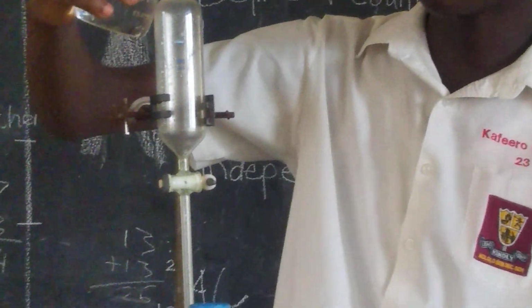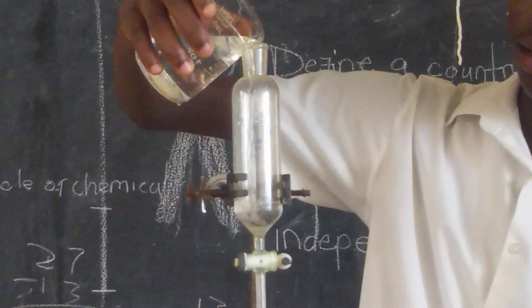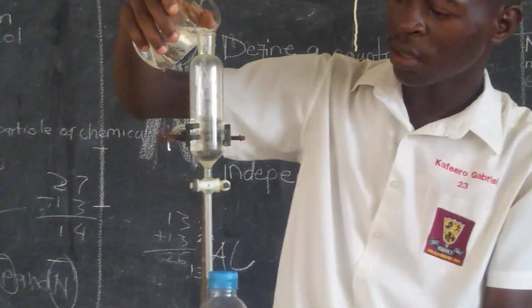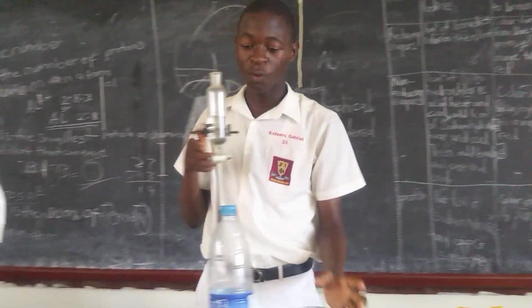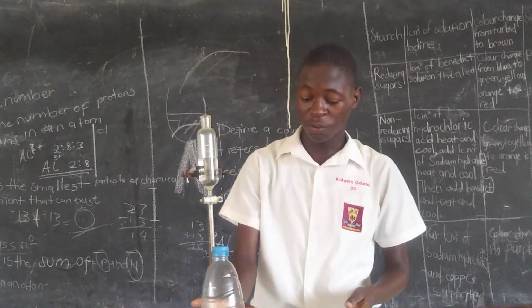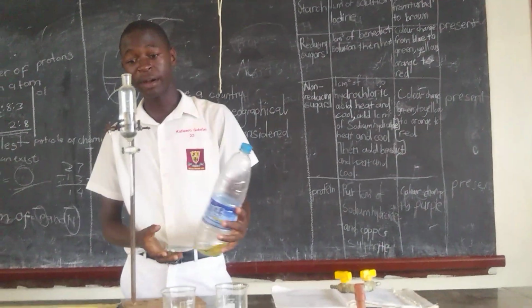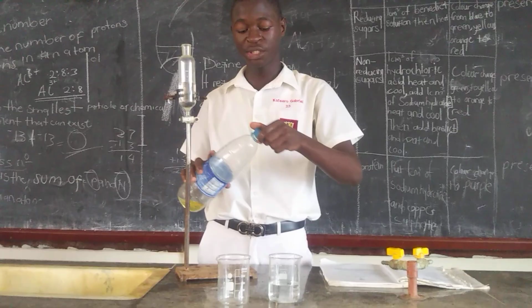Now I can pour my liquid. Let's see. When I pour the liquid, this water of mine won't pass through like the other time. So I have to pour it until it can be seen. Yeah, there, I think now you can see clearly. After adding this water, reaching half of the separating funnel, I just need to get our cooking oil, because our practical is about separating water from the cooking oil. So let's do it and see the outcome.